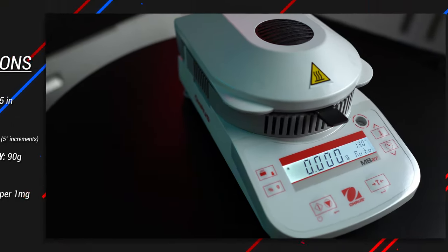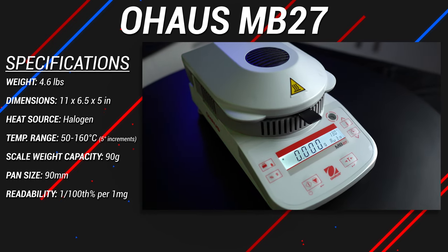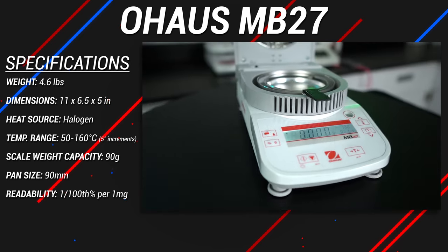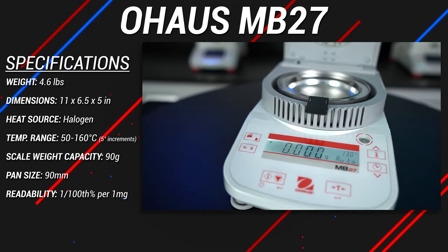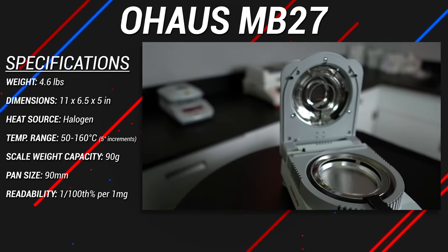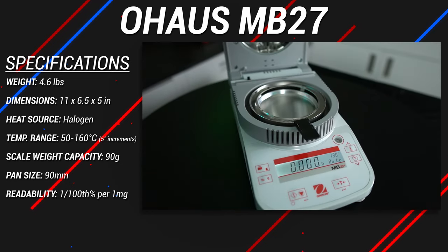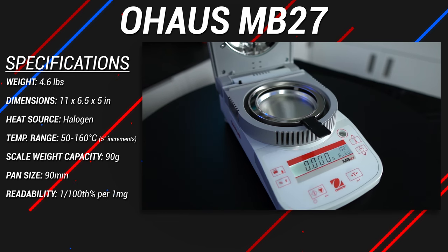This is the OHAS MB-27, weighing in at 4.6 pounds, measuring 11 inches in depth, 6.5 inches in width, and 5 inches in height. This unit uses a halogen heating source, and its temperature settings can range between 50 degrees Celsius to 160 degrees Celsius, but only in 5 degree increments. The maximum weight capacity of the scale is 90 grams, and holds 9 centimeter aluminum dishes. The MB-27 is the least accurate in the current MB-Series lineup, being able to read 1/100th of a percent per milligram samples.